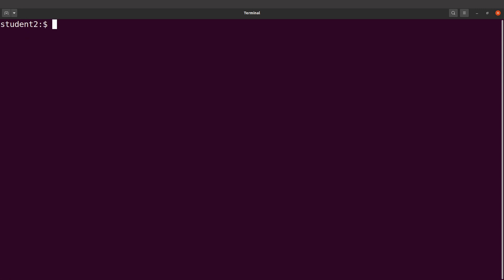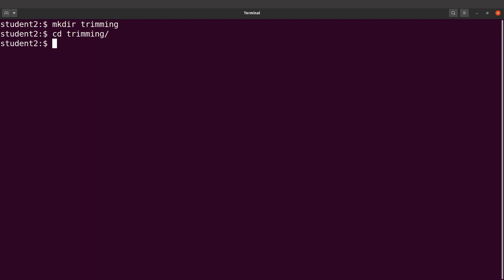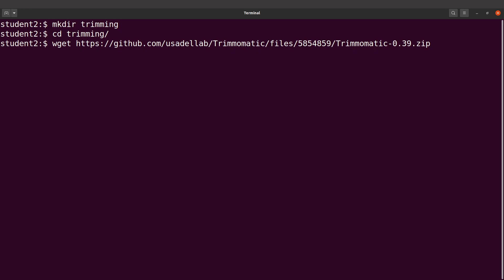What we are going to do is download the zip file. Let's say you want to perform a trimming activity and you need to set up Trimmomatic, so you have to create a directory. I will run mkdir to create a directory called 'trimming', then cd into it, and then download the zip file which has the JAR file. I'll use wget and supply it with the download link. Let's execute this command.